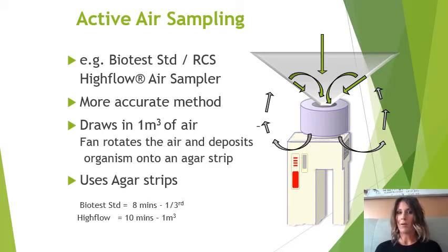In my unit, our air sampler uses 90mm settle plates. However, you can use agar strips, you can use contact samples, so it depends on the piece of equipment you've got.